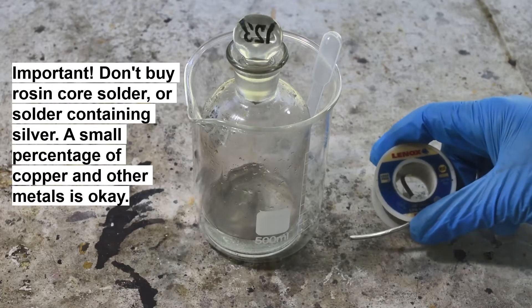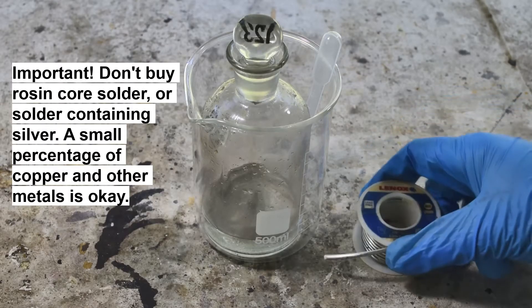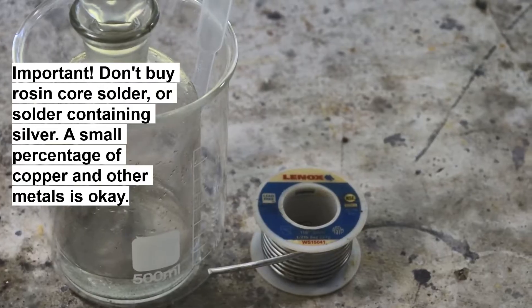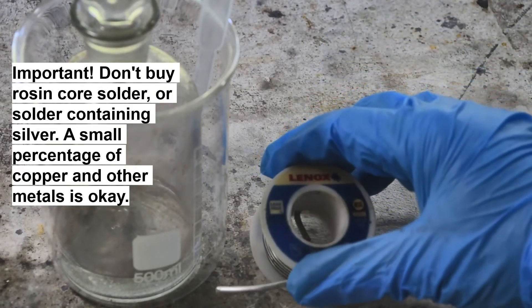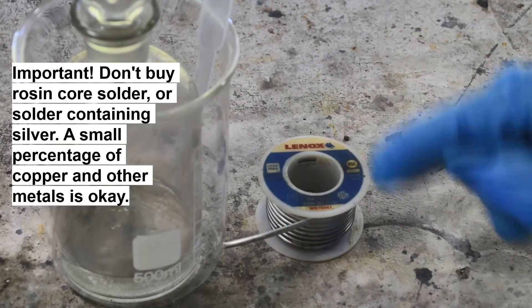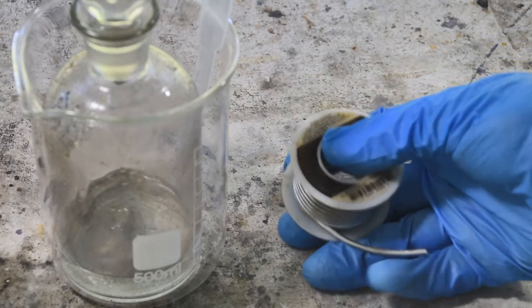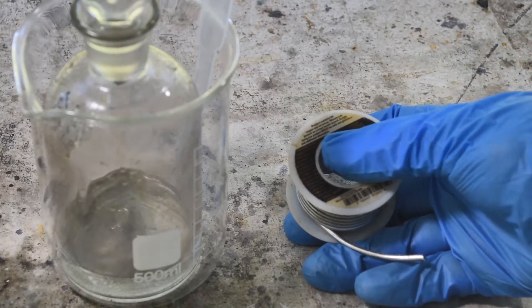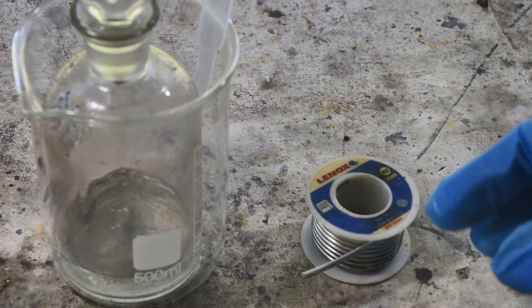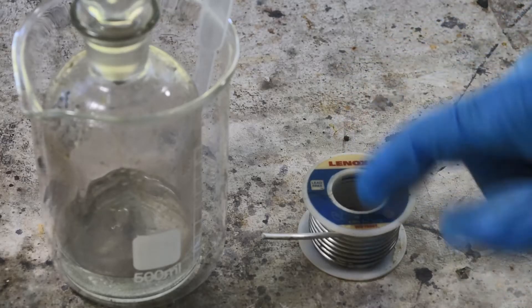You can get lead-free tin solder in just about any plumbing supply store or online. The important part is it has to say 'lead free' — that means it's almost entirely tin, but not 100% tin. If you read the fine print you'll see this contains a little bit of copper and selenium, and probably other brands have a slightly different formula. Those other metals are in there in very small quantities.